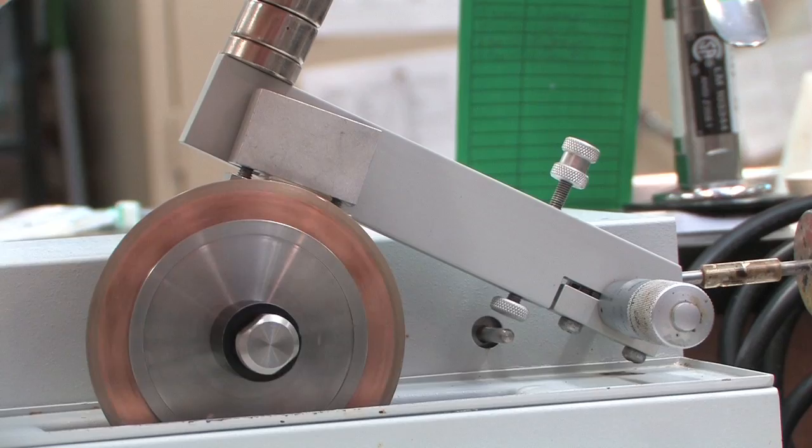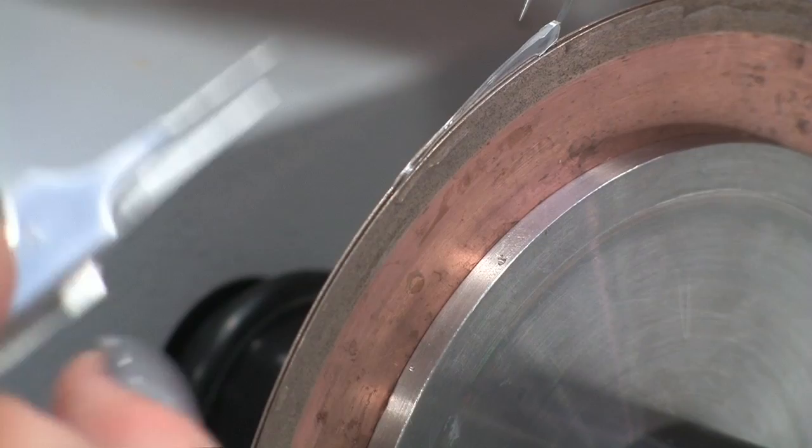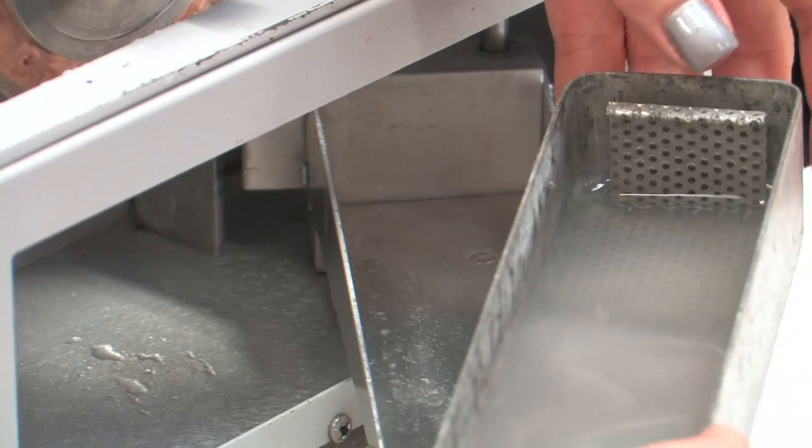Sometimes the cut sample disappears after the cut is made. If you can't locate the section once you have made the cut, it is probably stuck between the blades or it has fallen into the reservoir. Open the reservoir and remove the screen to locate the section.